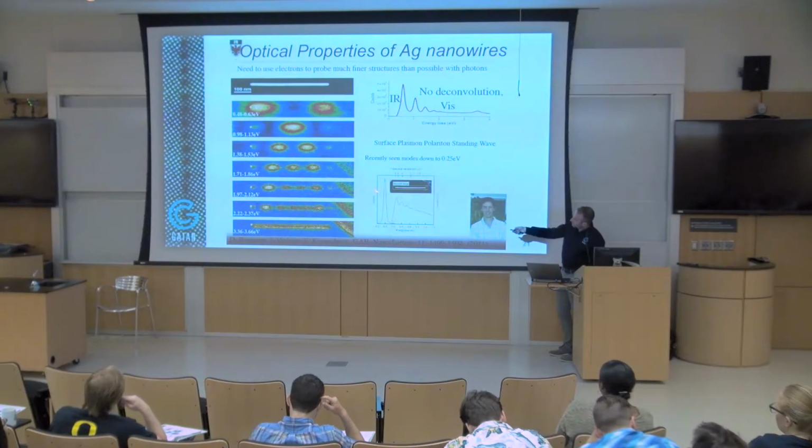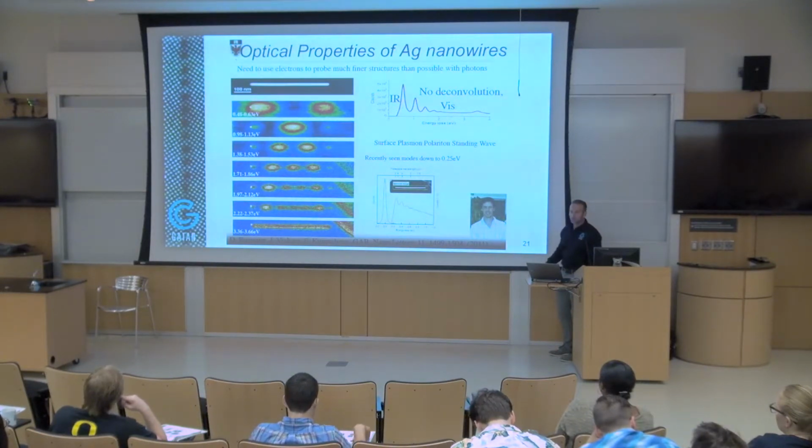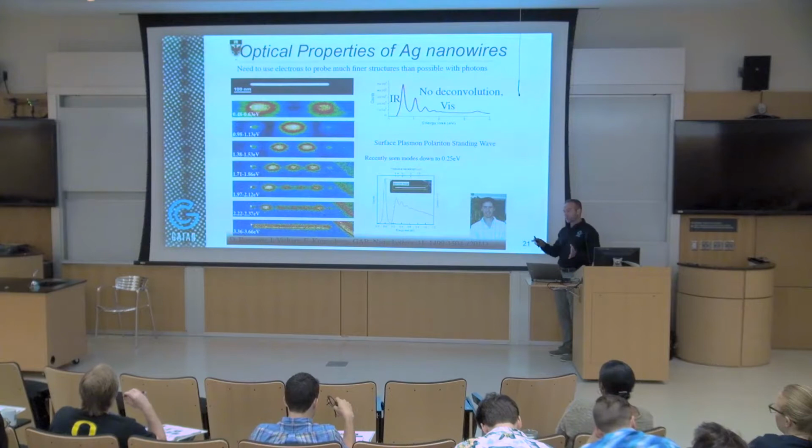Probably this one is very complicated because it's very close to the zero loss peak. Okay, so you have to make sure to get your zero loss peak as narrow as possible.